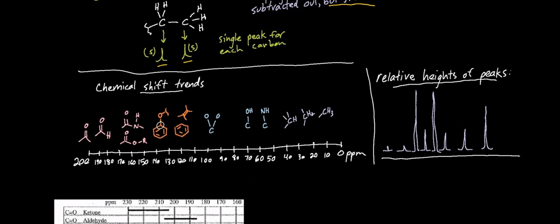General chemical shift trends in carbon NMR, they're very similar to the proton NMR trends. One thing is that methyls progressing to methylenes and methynes, useful terms for those, you see a progressively deshielding effect. So all things equal, the CH is going to be much more deshielded than the methyl. Heteroatoms attached to carbon, if the carbons are not unsaturated further, like a double bond, are in this region very characteristically.